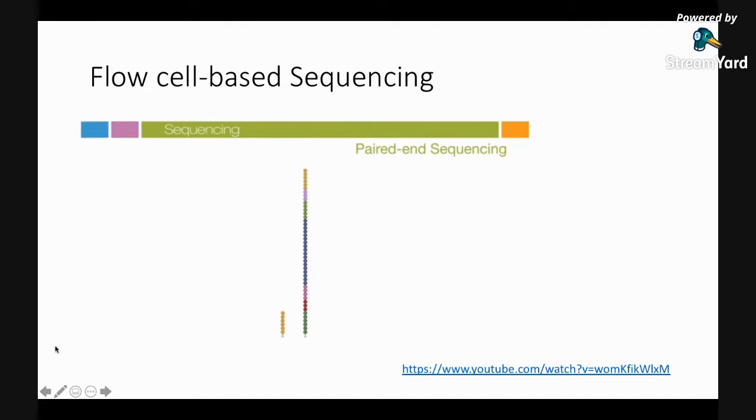So this is now the difference between single-end sequencing and paired-end sequencing. Right now, what have we sequenced? We have sequenced one side of your cDNA, typically depending on the flow cell, from 25 base pairs to 250 base pairs. So we have sequenced one end of your cDNA, index 1, and index 2. Now, if you stop your sequencing reaction at this stage, this is called single-end sequencing. So you have sequenced your sample barcodes and one side of your cDNA.